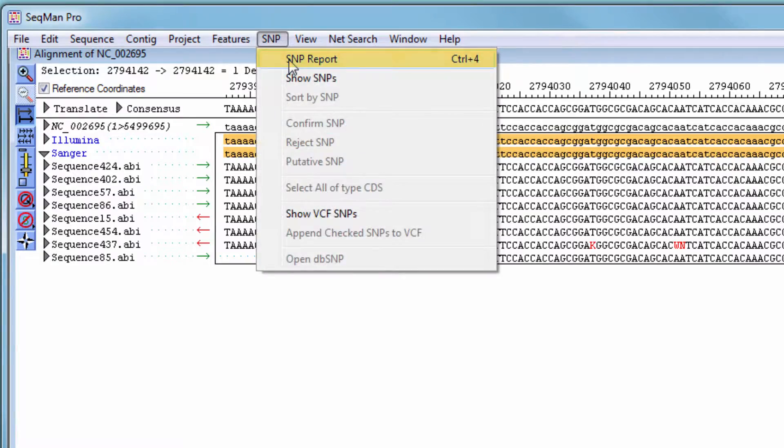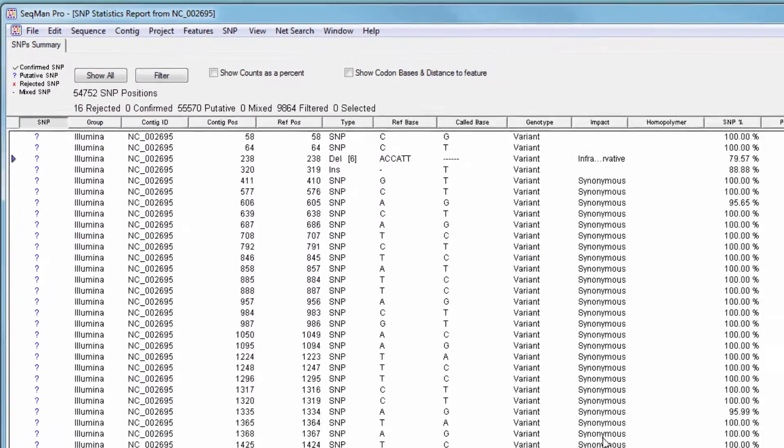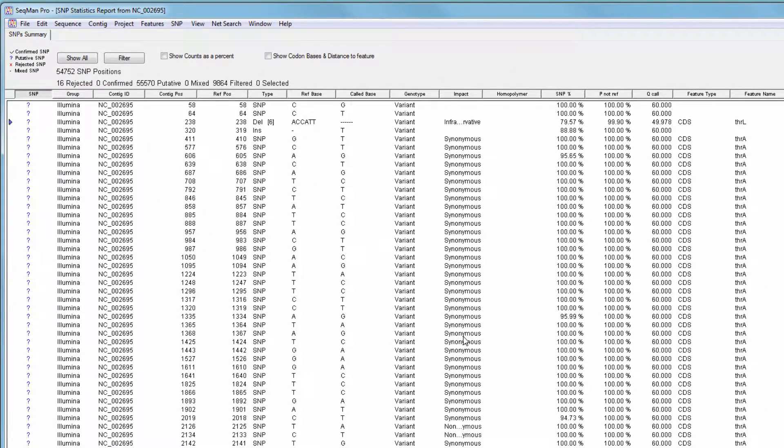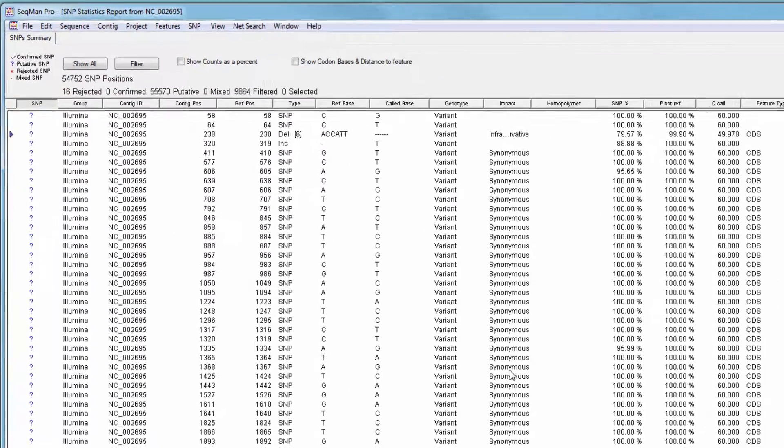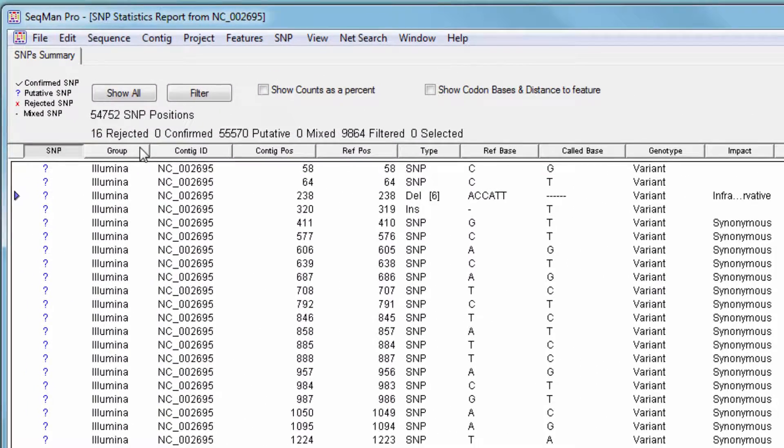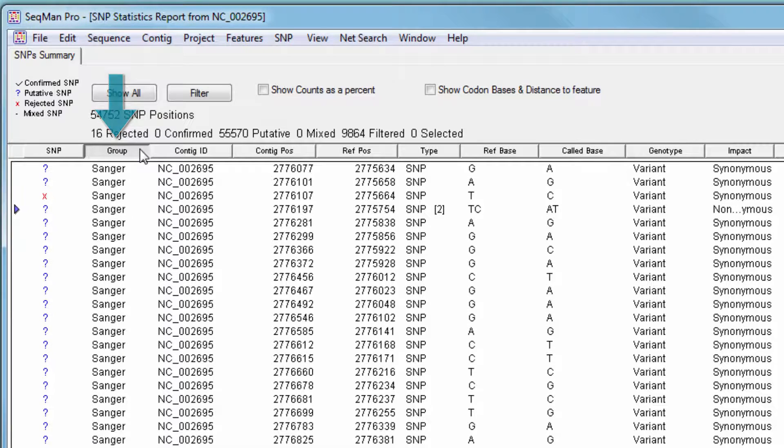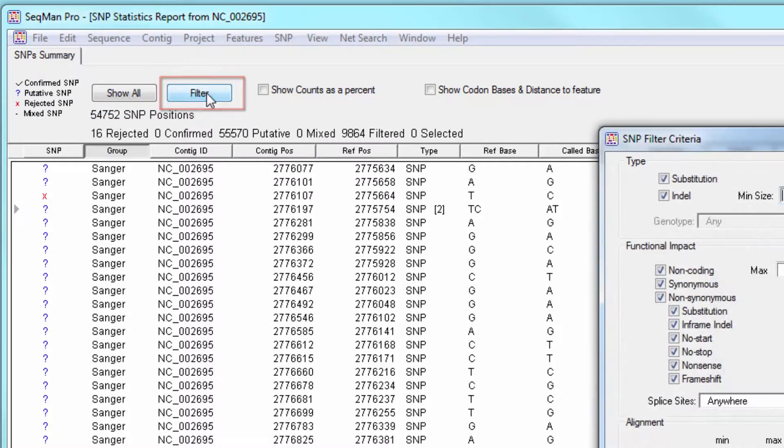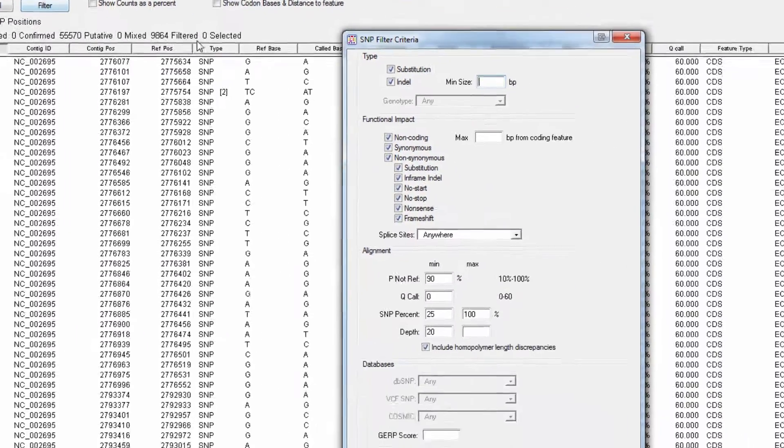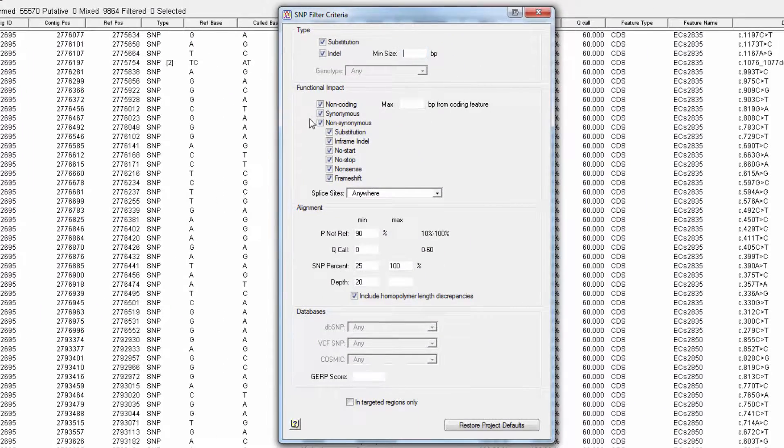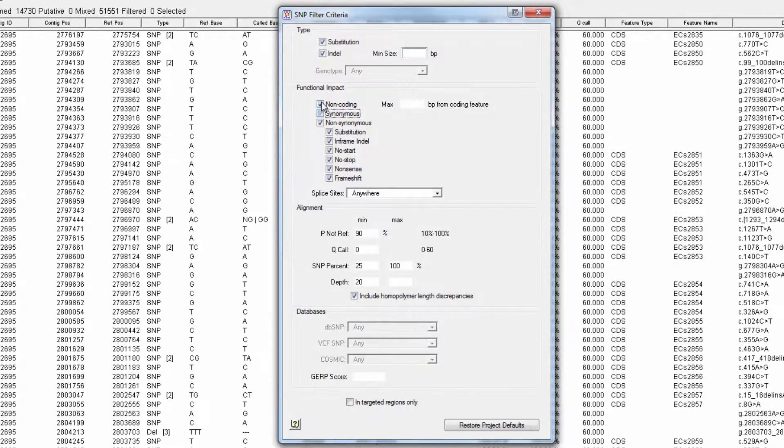Use the SNP report to locate variants of interest. Here, you can sort by group to group the variants from each read technology together, and use the available filtering options to narrow the list down to variants of interest.